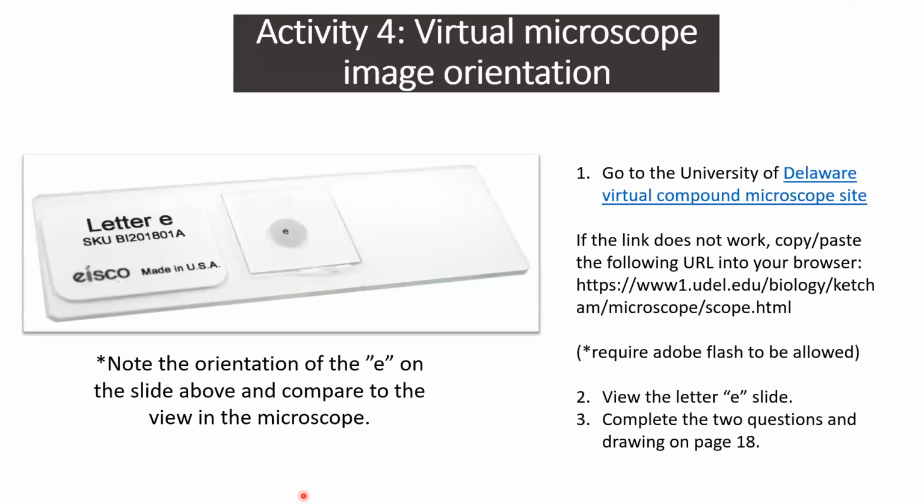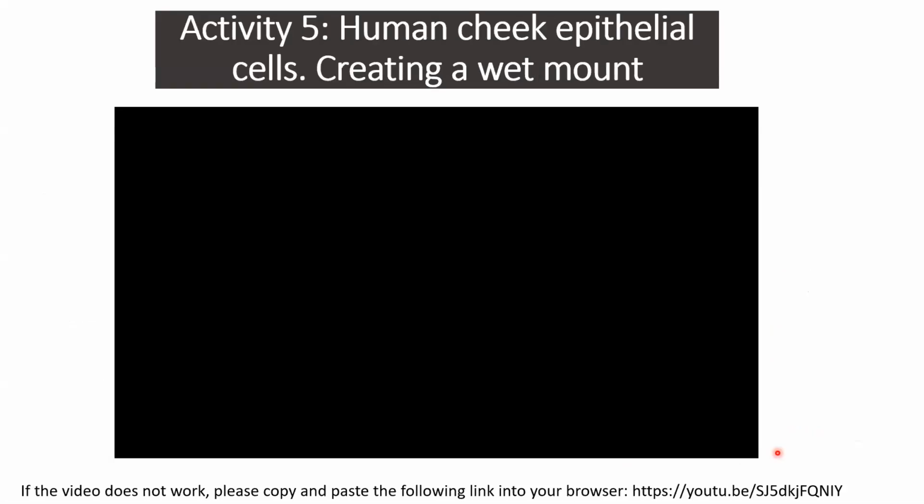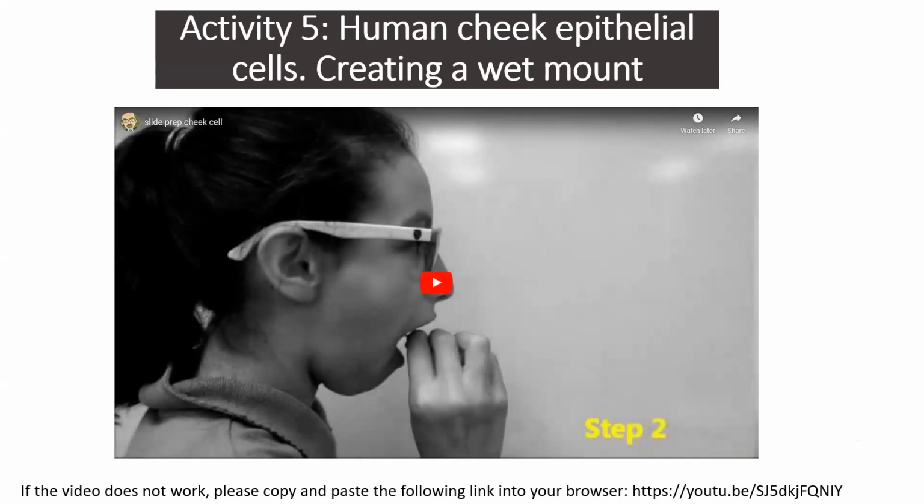So when you guys go to that site, you will be able to look at a microscope slide that has this E on it. So put this microscope slide into your microscope and complete the 2 questions and drawings on page 18. You will also watch this YouTube video.